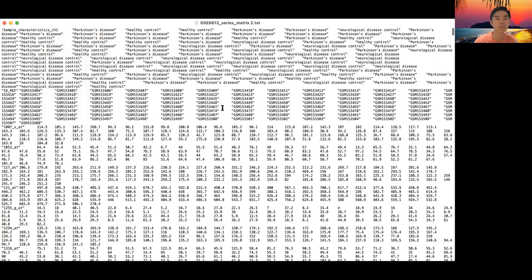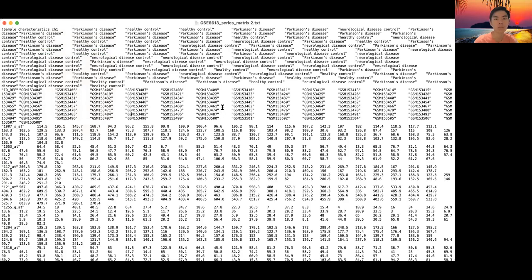We've done this part, and the next part is to upload it into Google Sheets. So let me just share my Google again. Oh, I need to enter my password. Don't hack me, please. Okay, oh, I'm not actually sharing my script tab, am I? Okay.